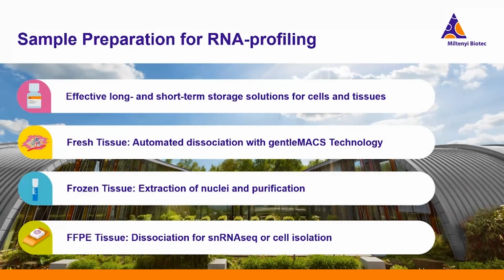All right. So also warm welcome from my side. So now after having Heinz presented you our solutions for short or long-term storage, I will pick up the line of thoughts and talk you through some of the sample preparation workflows with different tissue input materials. So these workflows are, in our opinion, the best practices for fresh, frozen, and FFPE tissues if you want to perform NGS applications. Starting off with fresh tissue.